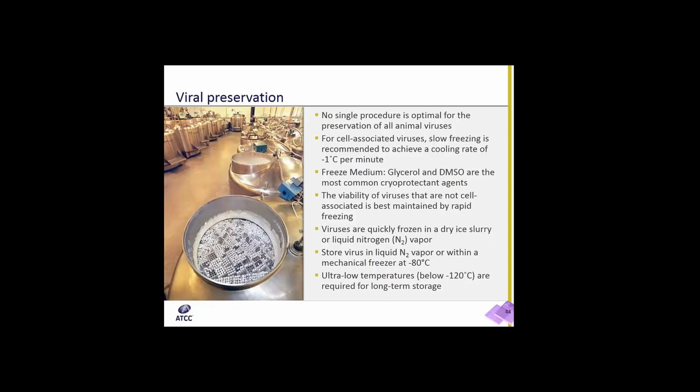There are two materials to choose from for cryopreservation vials. Either you can use glass or plastic. Glass vials are more difficult to work with. They need to be sterilized before use, and they generally do not come with labels, such as information that is imprinted onto the side of the glass. They need to be sealed with a hot flame, and they can be quite difficult to open. More often, it is the cryovials that are used, and that is what we would recommend.